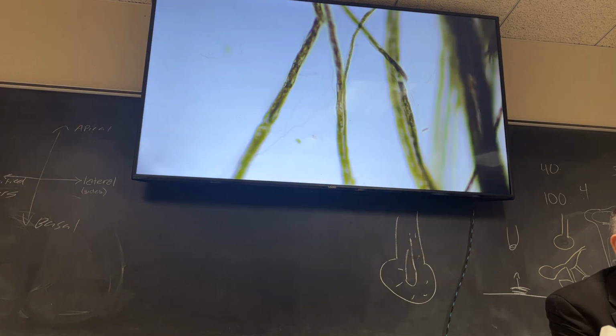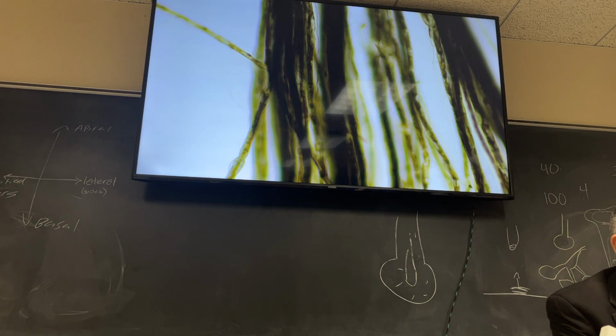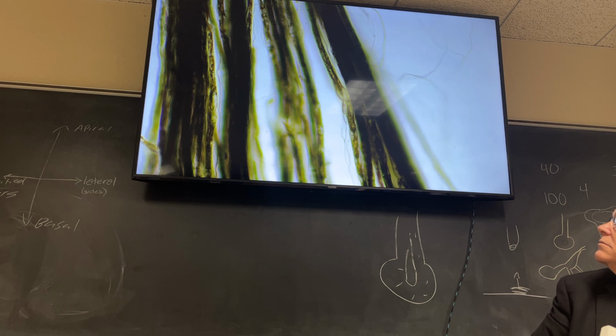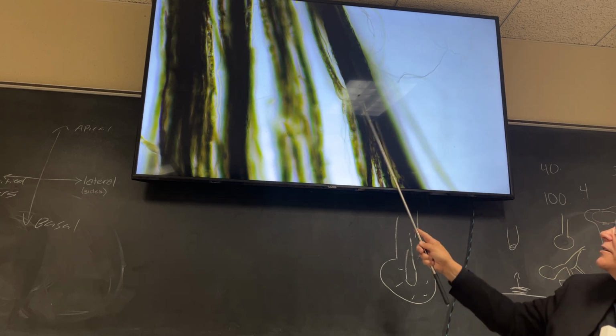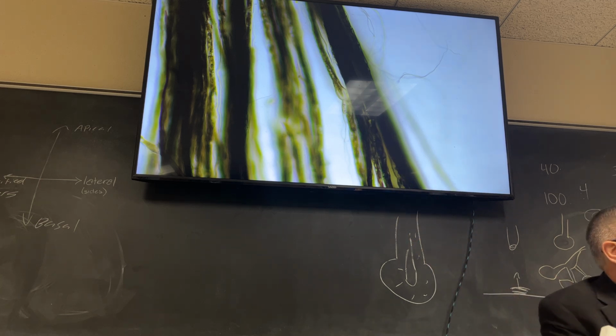Gotcha. How about that one? So the spot that doesn't have any myelin is this spot right between them, that's it. It's not a very big amount of space that doesn't have myelin, but it's a small space that works. Okay.